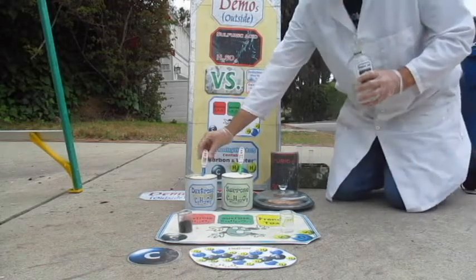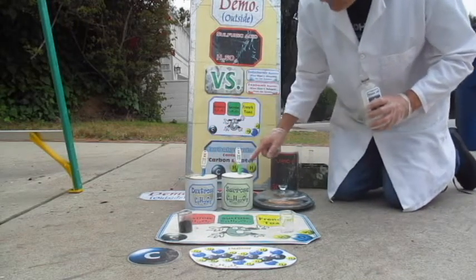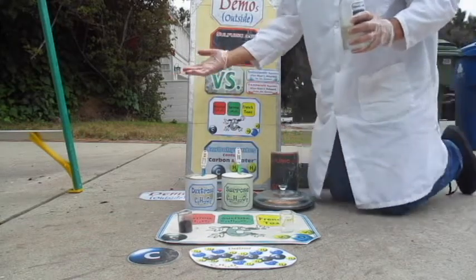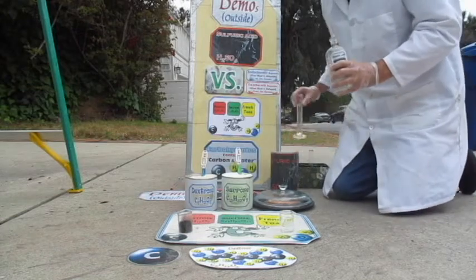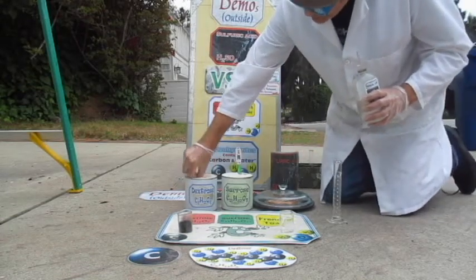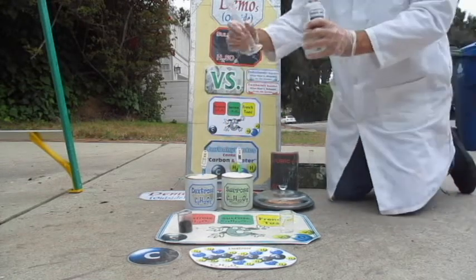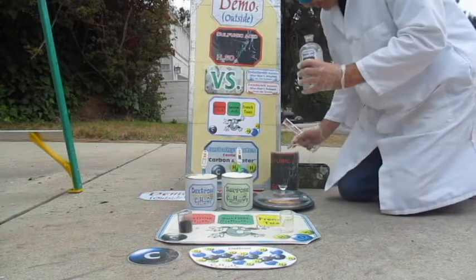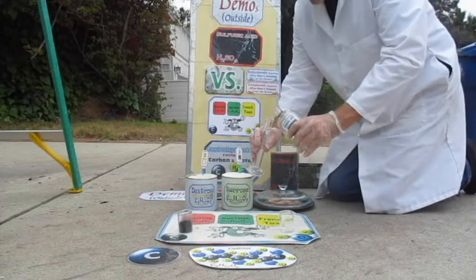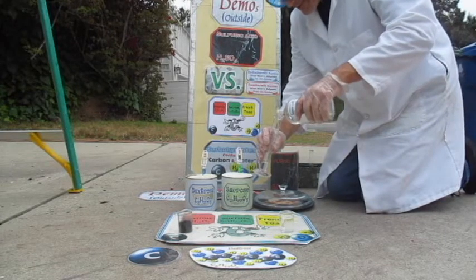So I've got thermometers in here. This one is 21 degrees Celsius. This one is 23.4. These cans are at different temperatures for some reason. I'm not sure why. What I'm gonna do is make a little depression in the middle of each one, and pour in each one 50 milliliters of H2SO4. It doesn't have to be exact, just approximately 50.